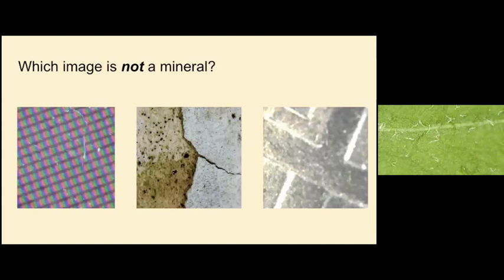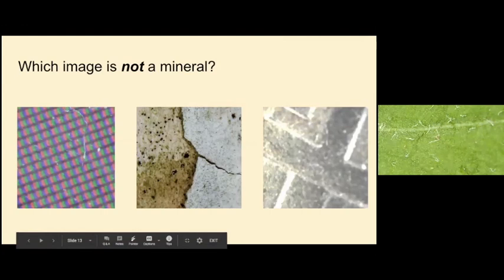Maybe the second one isn't. What makes you think it could be that? You know those trees that are white? The bark could have fallen off, so it looks like it's brown and white. That's a pretty great observation. But that's just a possible explanation. That's definitely possible. Does anyone have any thoughts that could either confirm or deny what Jacob was saying?